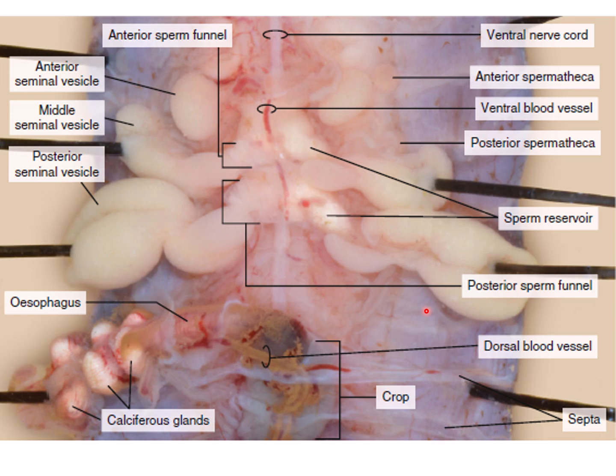The ovaries are present in segment number 13, but we cannot find them because it is very hard to find them. And the pair of oviducts with ciliated funnel that carry eggs to the female genital pore in the next segment, that is segment number 14, will also not be observable.